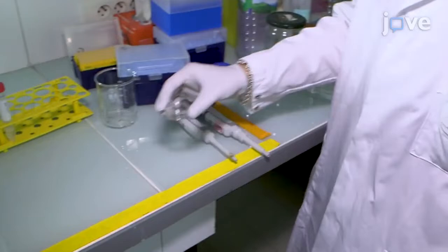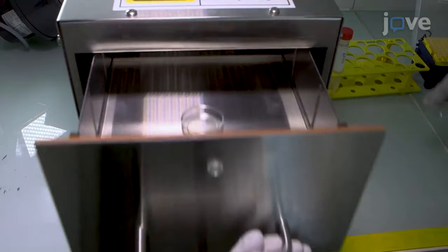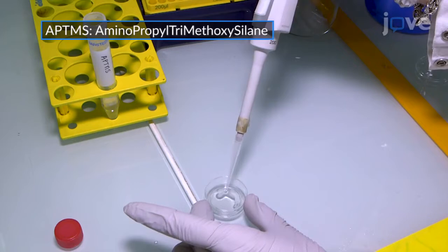Begin by silanizing the gel support. Activate the cover slip or glass bottom petri dish with a UV lamp for two minutes. Then, silanize it with 200 microliters of APTMS for five minutes. This will prepare the support for the covalent binding of the gel.